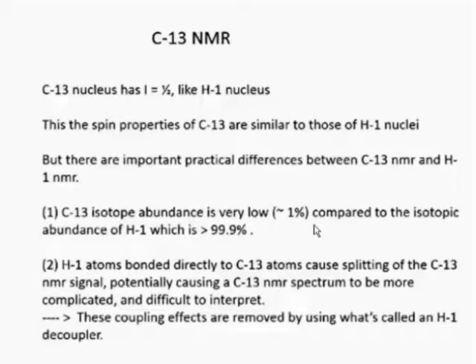But modern NMR instruments are so sensitive they actually can see the low abundance of C13 nuclei. And also, when one does a C13 NMR spectrum of a compound, one follows this procedure. Numerous repetitive scans are carried out, on the order of 50 or 100.